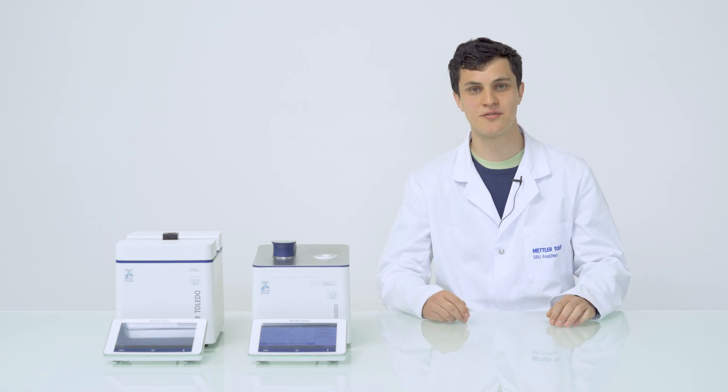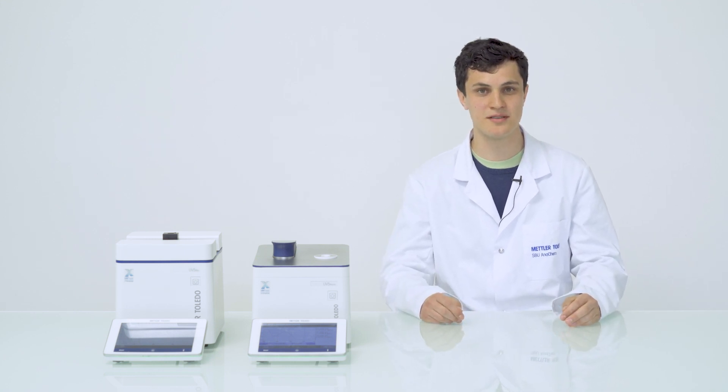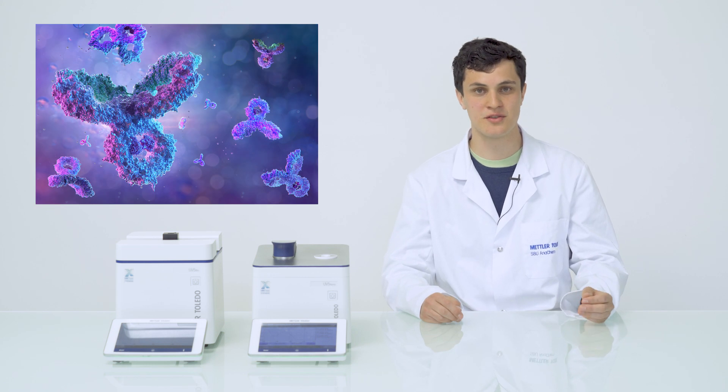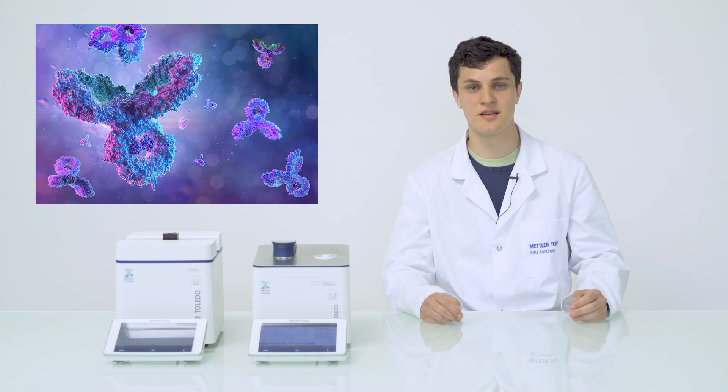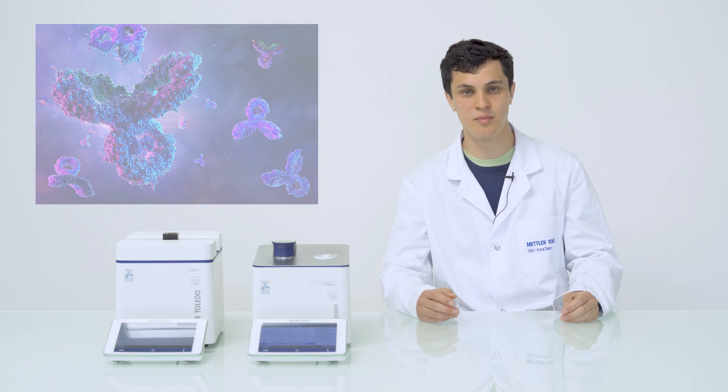In cell and gene therapy, high quality and pure DNA and proteins are of utmost importance. UV-VIS spectrophotometry can be used to analyze bacterial cultures, viruses, plasmids, and proteins.